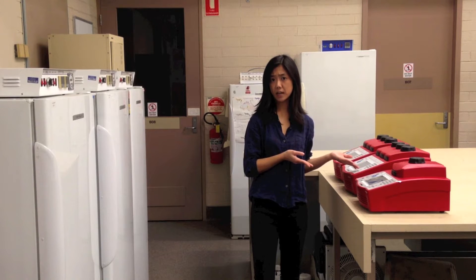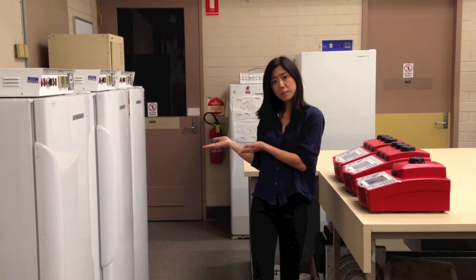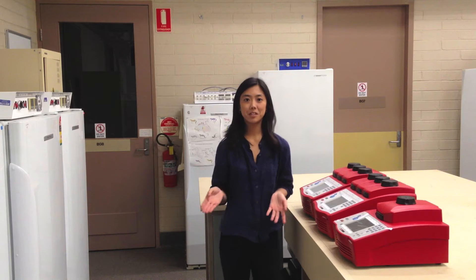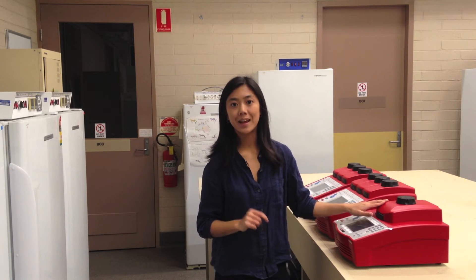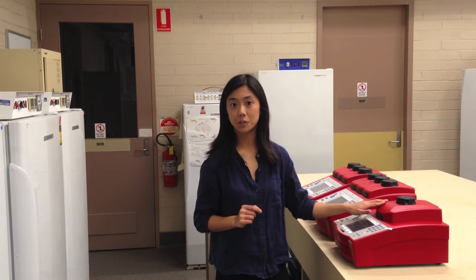But why should you use a thermocycler instead of an incubator? When we measured the performance of a thermocycler we found thermocyclers were precise and accurate. The lid of a thermocycler also contains a heating unit if you need that extra temperature control. As their name implies, thermocyclers are able to run fluctuating temperature programs, which is perfect when you want to simulate field conditions in the comfort of your own laboratory.